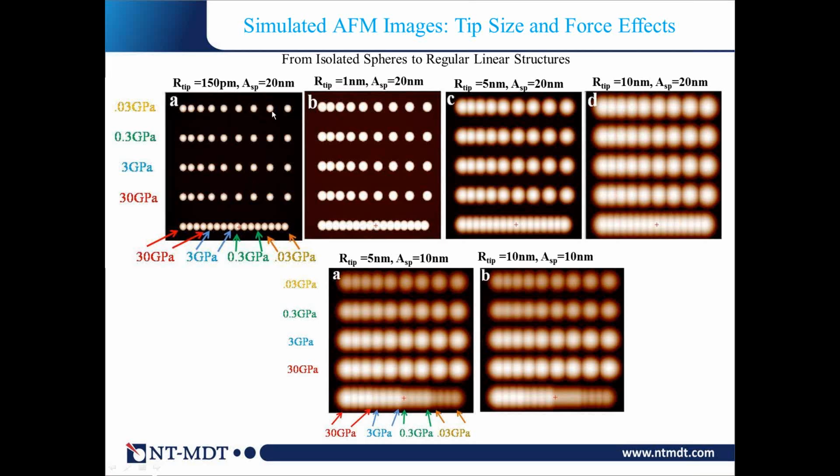Now we can look at how these balls appear in the AFM images, because what we get in the image is still an image. It's a representation of the real world, but with the contribution of the tip, and the contribution of tip-sample force interaction can change something. Therefore, we shouldn't be fooled by the images, because extracting true quantitative information from the images is not as simple as you might think. But that's what we need to do in many cases.